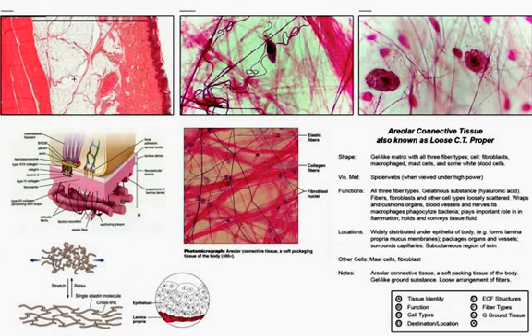Now, what we focused on in this slide is the areolar connective tissue, or the two-sided tape that's forming the binding and support of adjacent tissues that are unlike one another. So underneath the epithelial tissue here, we would find this tissue, areolar. In between any structure that's different from the denser regular of this layer, like these two blood vessels, the artery here and the vein, and if that has around it a different kind of tissue, which it would, this artery would be surrounded by a smooth muscle wall, as would this large vein, but it wouldn't always have muscle if it's a vein.